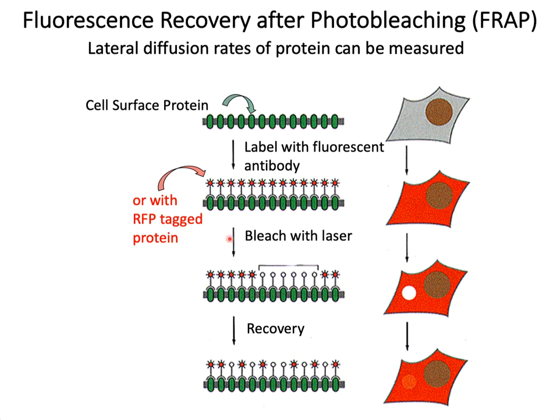The left panel is the cell surface with the green ovals representing transmembrane proteins spanning the plasma membrane, and the right panel represents a single cell as viewed by fluorescence microscopy. So you stain the protein of interest with a primary antibody, or with a primary antibody and a secondary fluorescent antibody, or label the protein with GFP or RFP, red fluorescent protein, as used here. Somehow you make the protein fluoresce. Then you apply the excitation light to the RFP fluorophore.